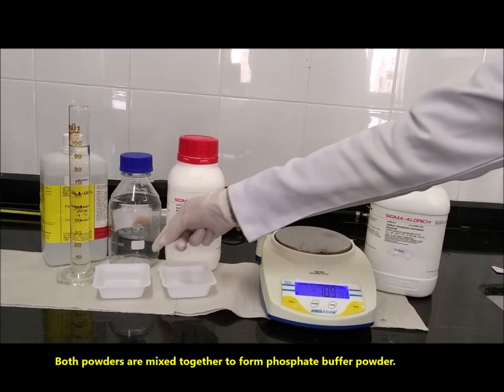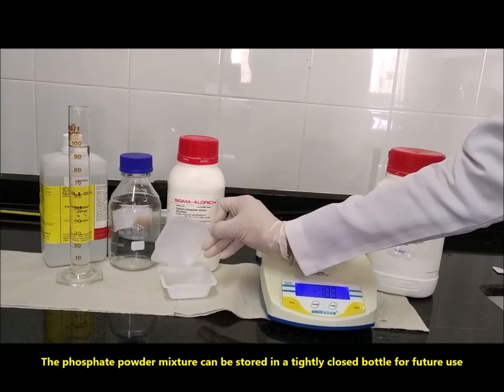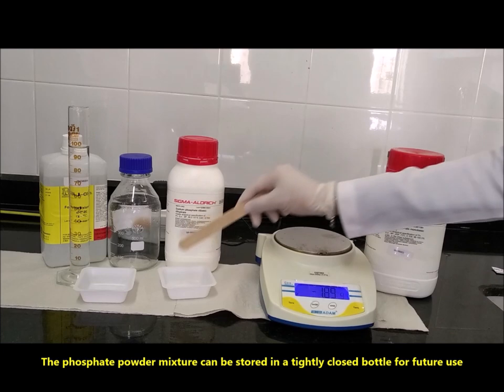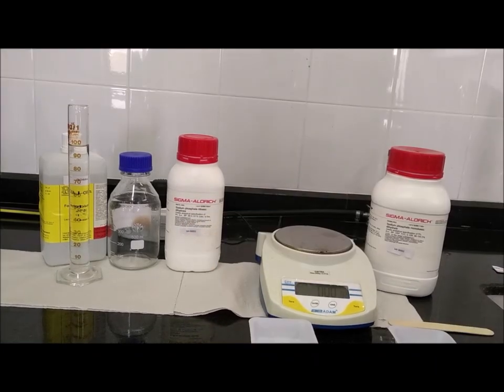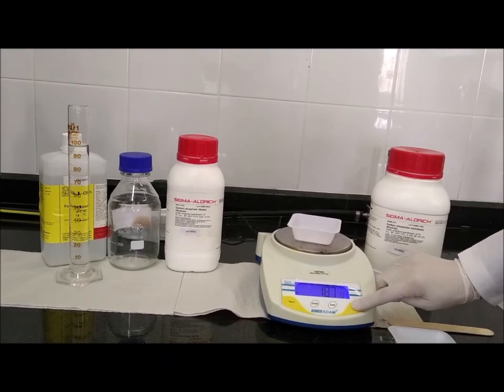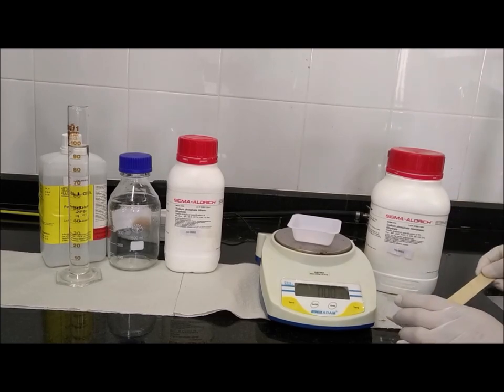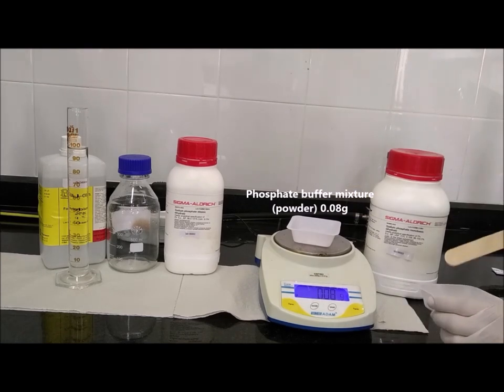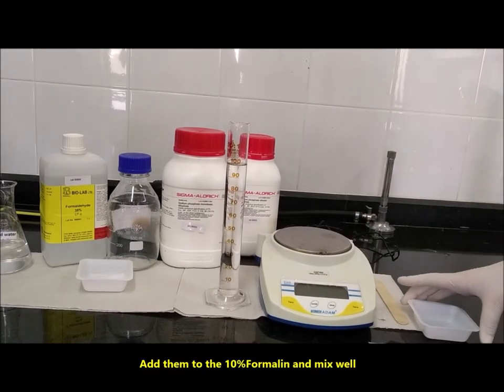Both powders are mixed together to form phosphate buffer powder. The phosphate powder mixture can be stored in a tightly closed bottle for future use. After this, weigh 0.08 g and add it to the 10% formalin and mix well.